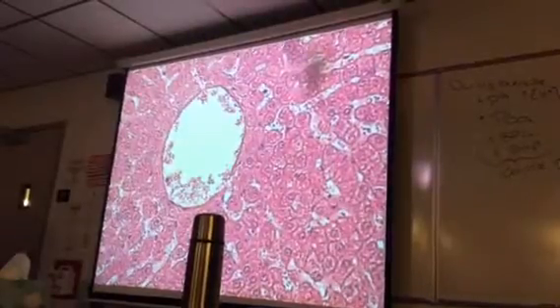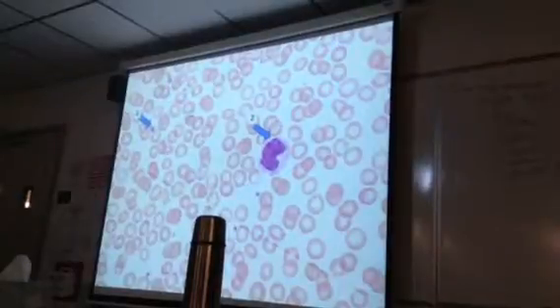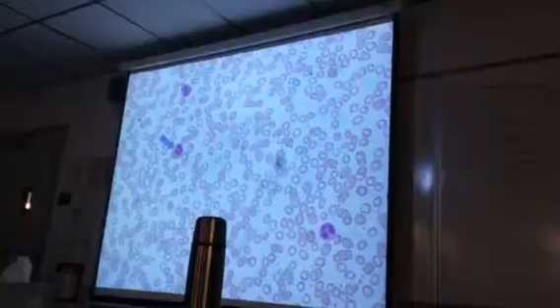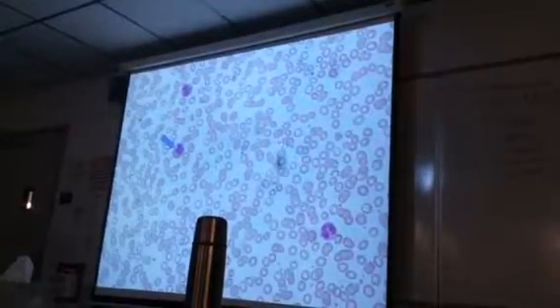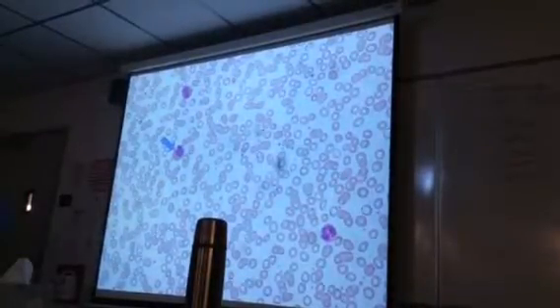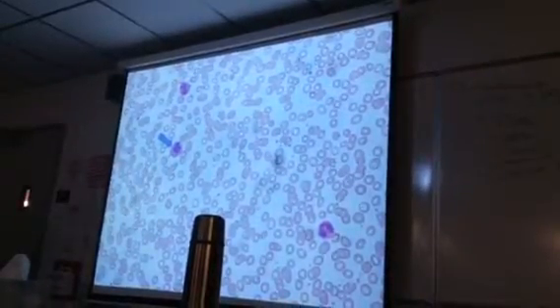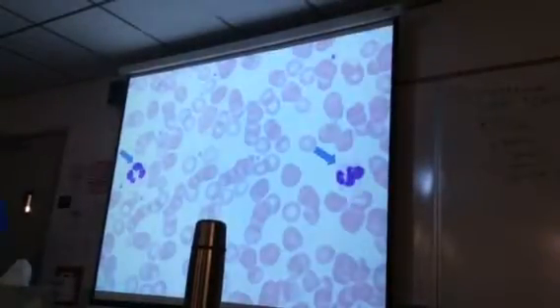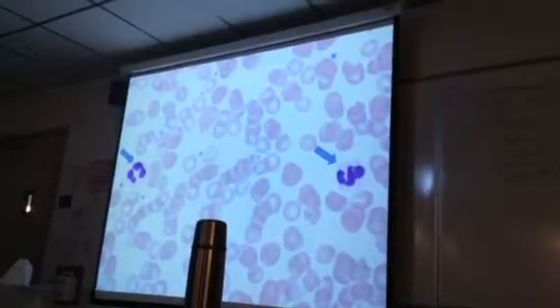Let's do blood. For the blood, just to be able to identify the different blood cells. Number 1, pointing to a platelet. Number 2, it's a monocyte. Blue arrow, I can point to that one, or that one. They're all eosinophils. This is probably the condition, if I asked you what blood condition is eosinophilia. To me, eosinophil. There's one up close. These two are the same. Neutrophils. Both of them are neutrophils.